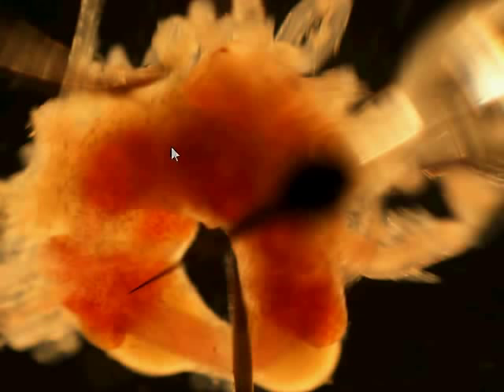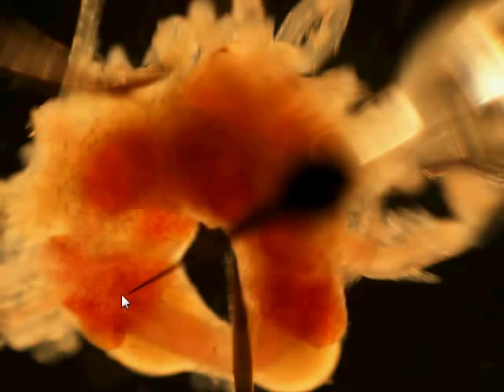What we see here is an isolated central nervous system of an adult Lymnaea stagnalis. Here is this central ganglionic ring, and what we can see here is a sharp micro-electrode which is impaling the large cerebral giant cell, or the CGC.